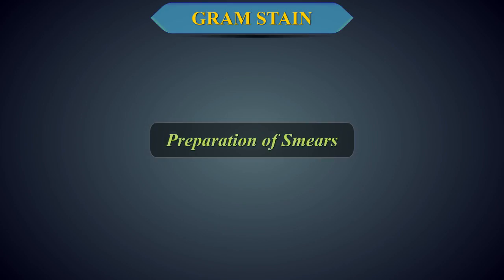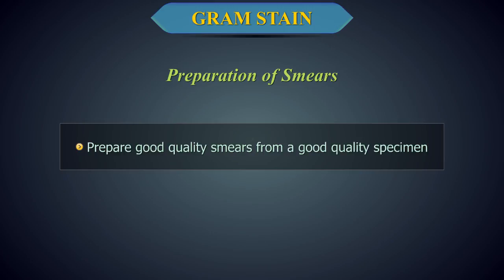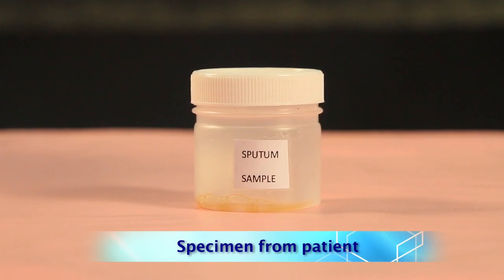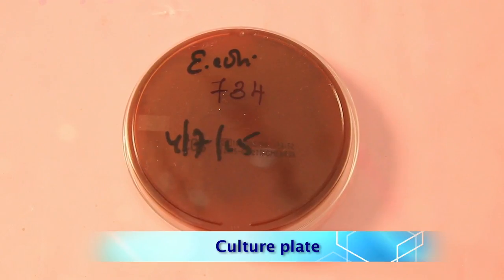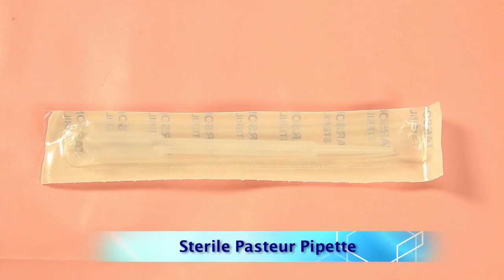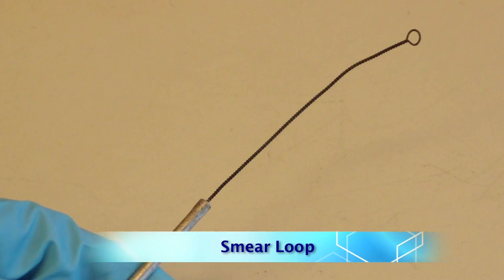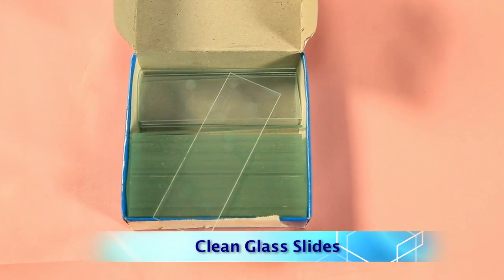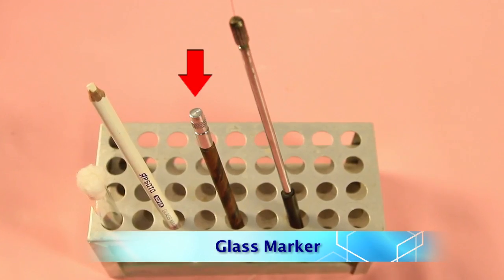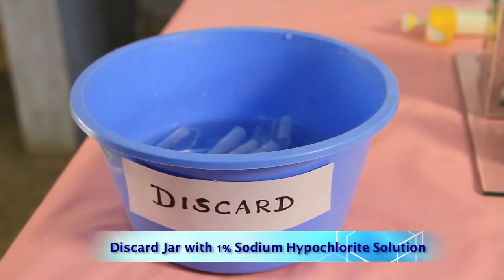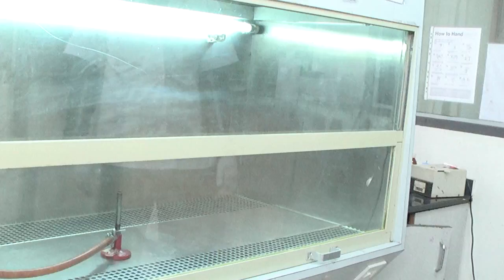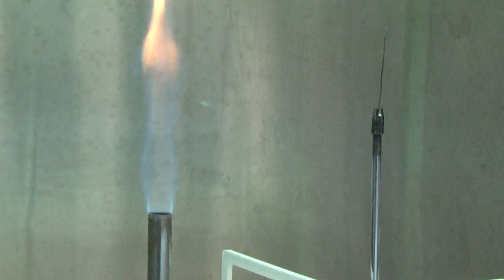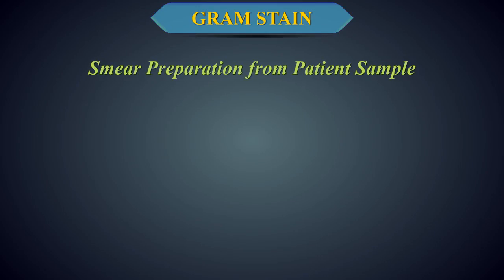Preparation of Smears. Before proceeding to staining, it is important to prepare good quality smears from a good quality specimen. Requirements: patient sample, culture plate with growth or broth culture, dropper or pipette, sterile inoculating loops, clean, dry, grease-free slides.